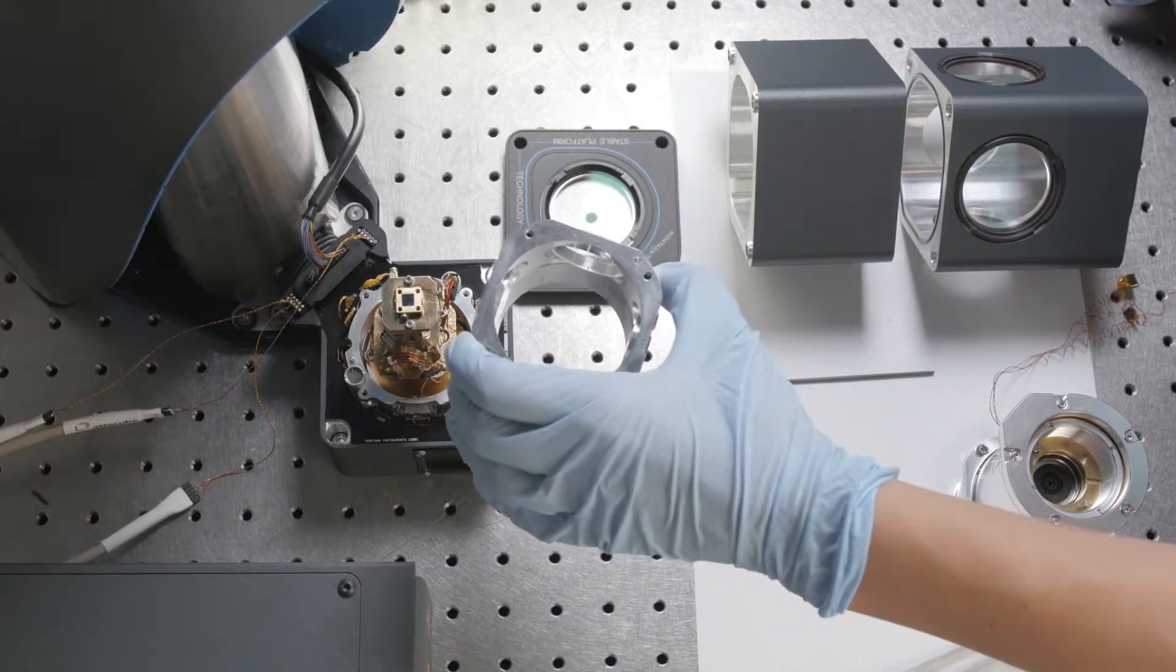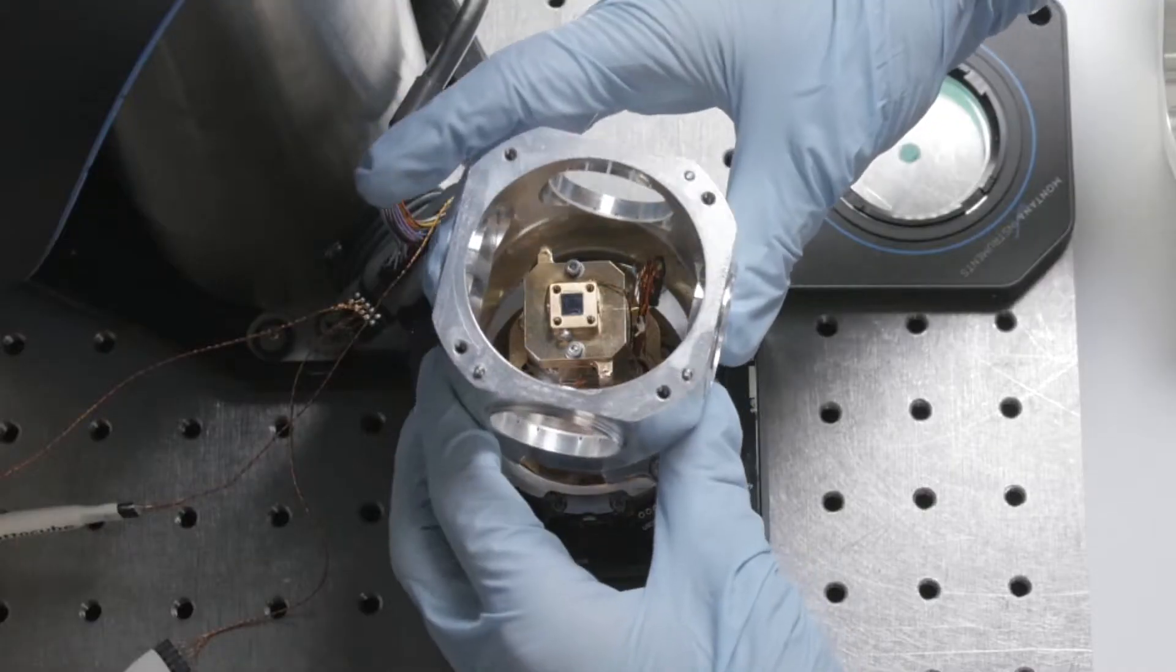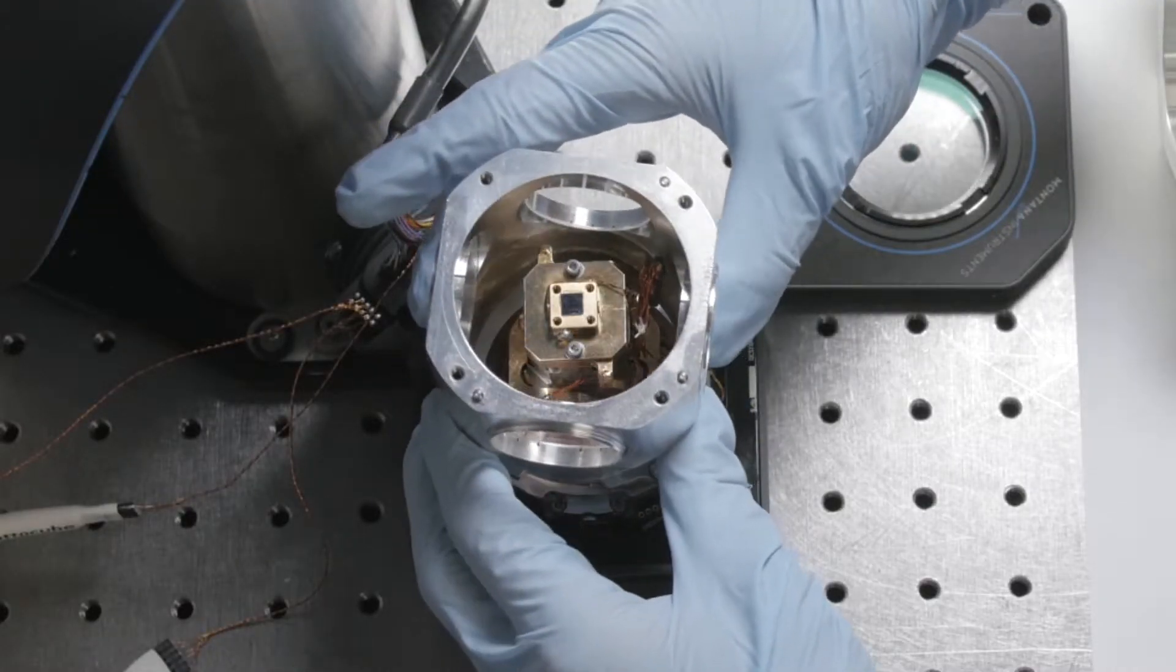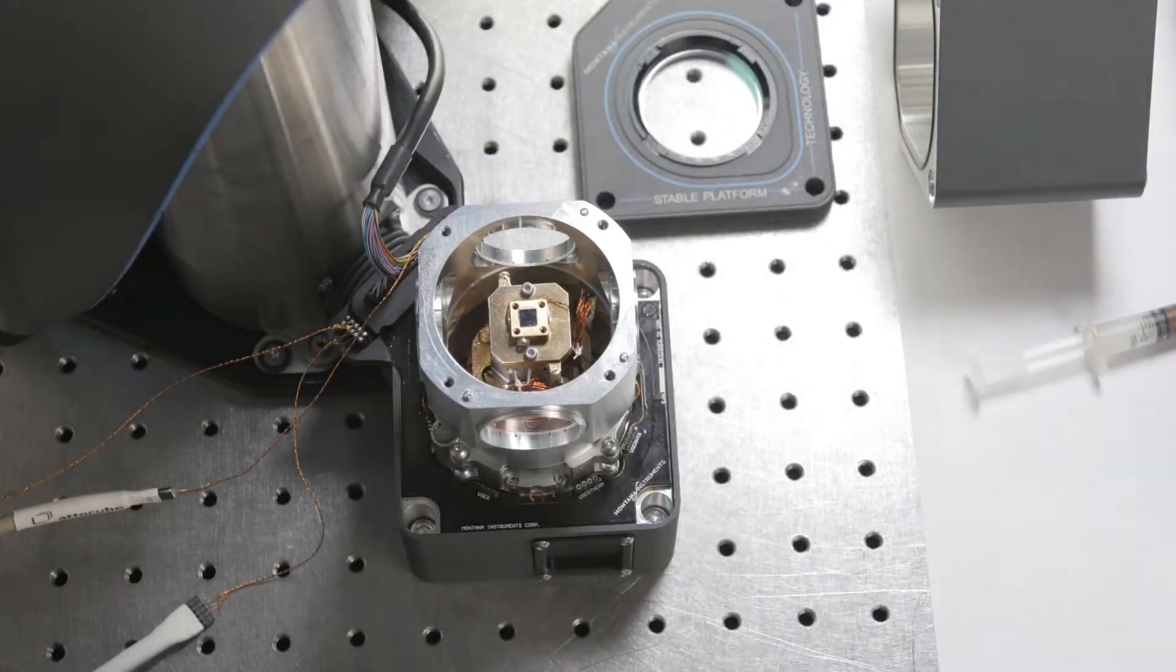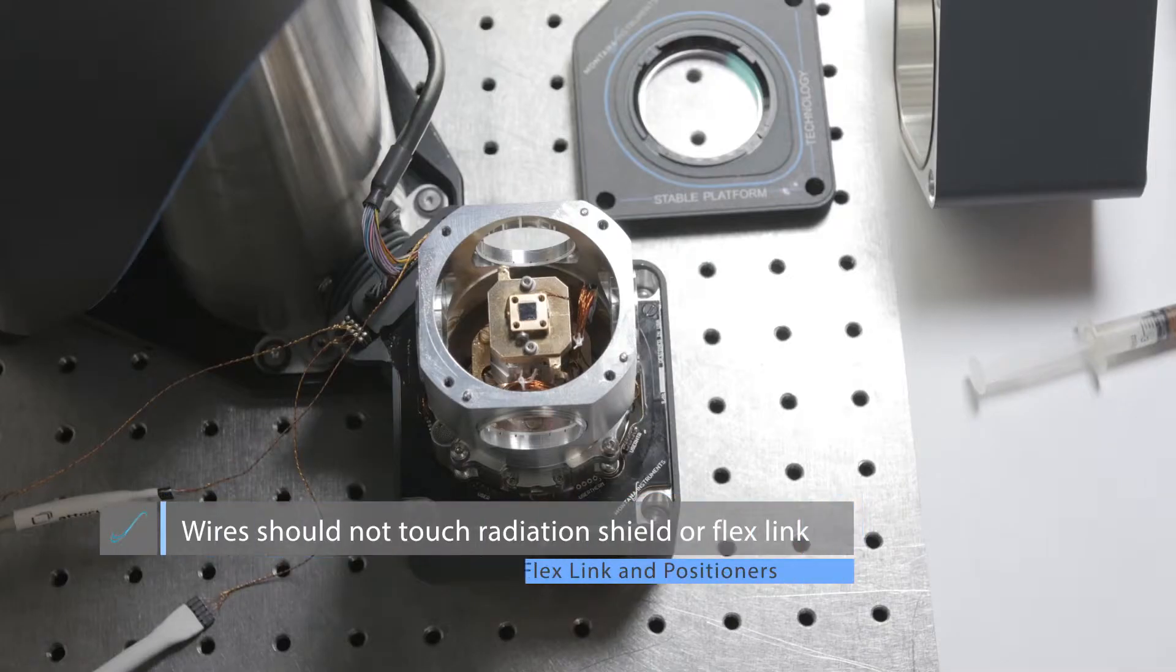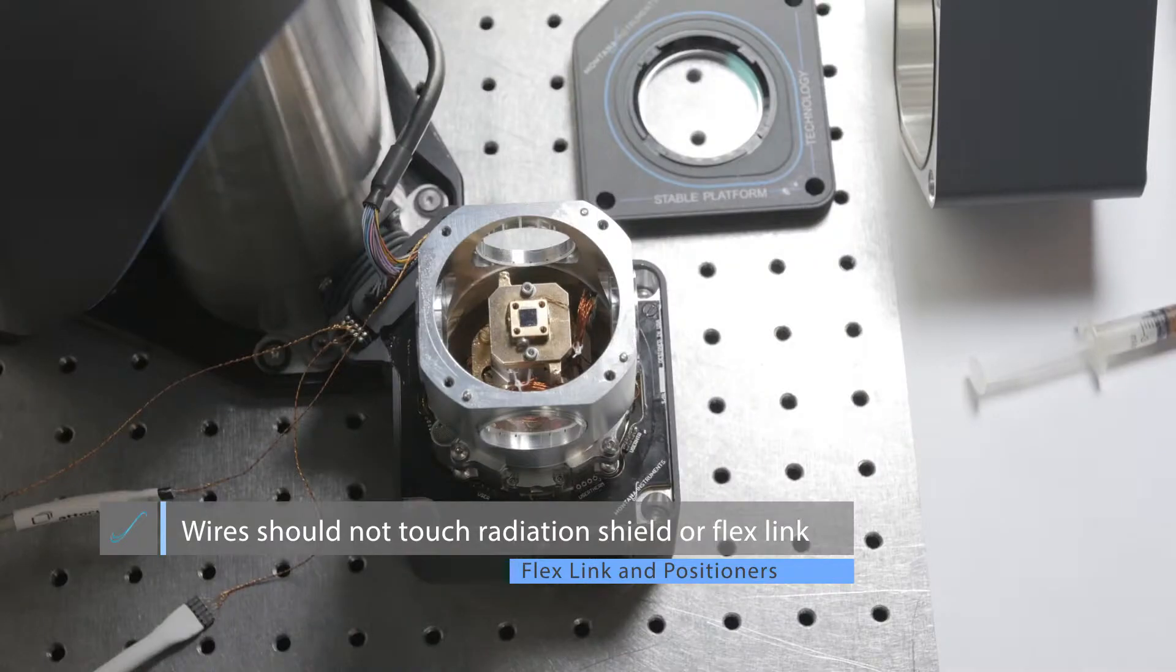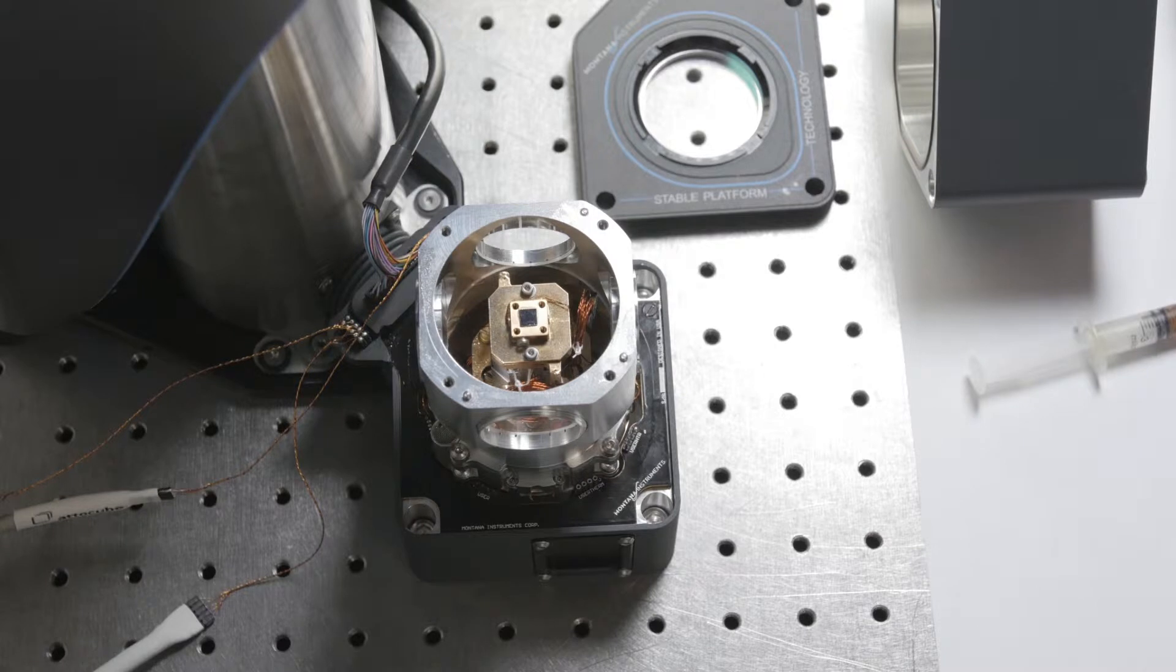Then we'll put on the middle portion of the radiation shield. Again, as you put on the radiation shield, make sure no wires touch. Before I tighten that down, I'm going to run the stages their full range to make sure that the wires don't touch the side of the radiation shield. The Z stage is probably the easiest and doesn't usually cause any touches.